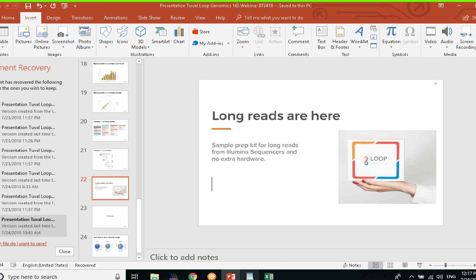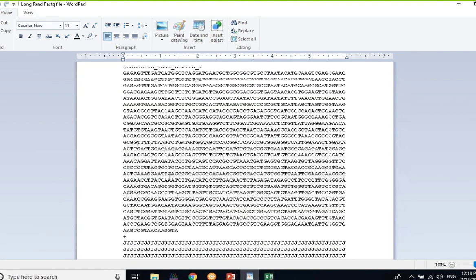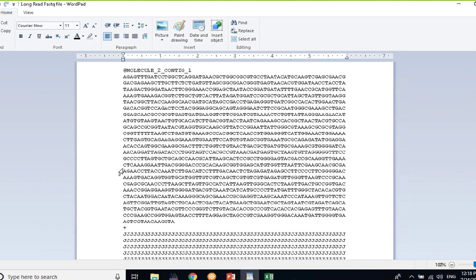Great. Okay. So if we answered all the questions that you had, that's great. Let me just run you through it. There were a few questions relating to what the actual output looks like. I won't go over the entire output files because they include a lot of files and a lot of visualizations. Let me just go through some of the most important or fundamental data files. So you can see the FASTQ file right now, right?